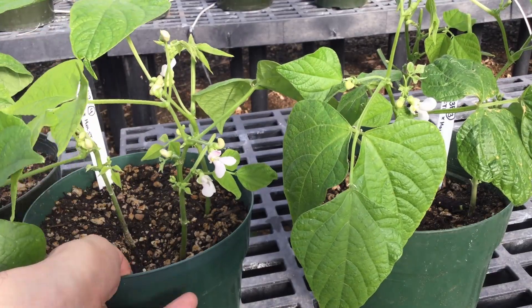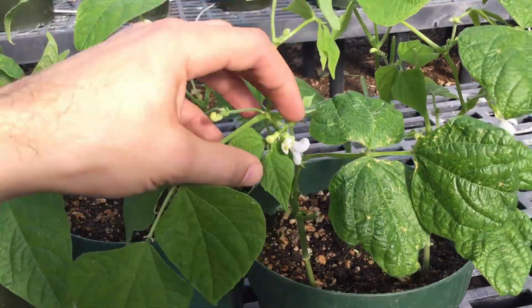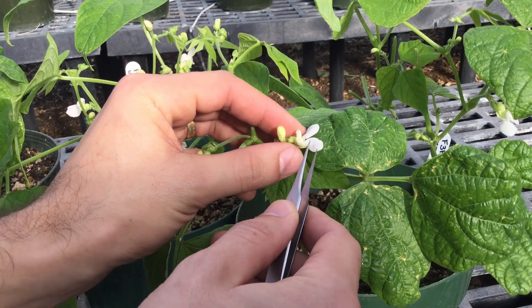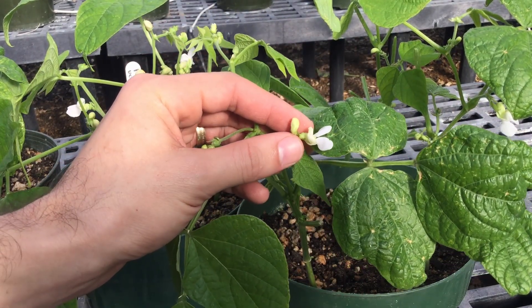On our plant that we're going to use as a mother, we want to have nice full-size buds like this, which are very close to being ready to flower.